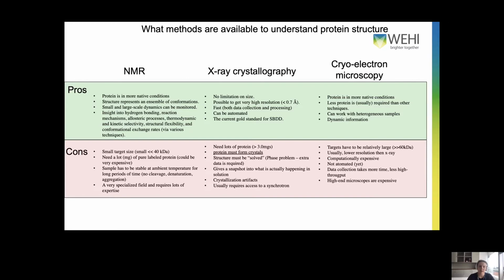However, it also has quite a few limitations. First, your proteins will have to be fairly small, usually less than 40 kilodaltons. It requires a lot of pure labeled protein, which can be very expensive. And then because the experiment is done over quite a long period of time, your sample needs to be stable at ambient temperature. And also it's a fairly specialized field and requires a lot of knowledge and expertise.